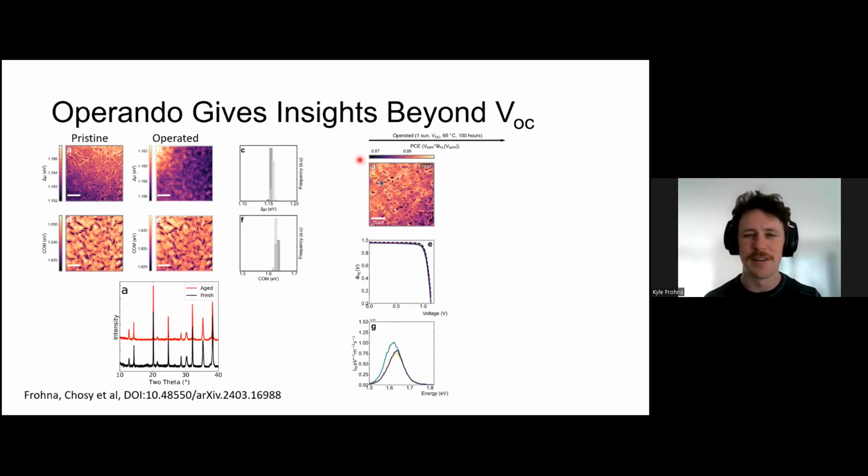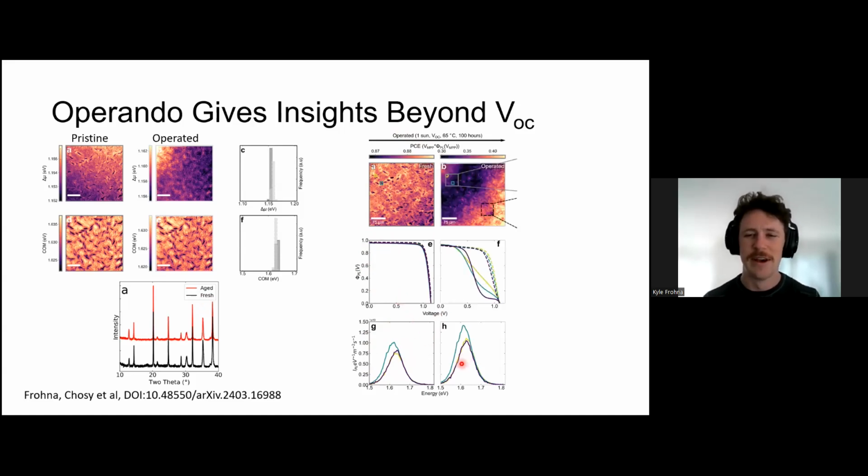Whereas here, this is a map of the PCE, current versus voltage curves, and PL spectra extracted from a few different points. We basically see that beforehand, it's quite homogeneous. Afterwards, the PL is pretty homogeneous again. But I've kind of given away the surprise by explaining it in this way: we see really big differences in the current versus voltage curves microscopically.